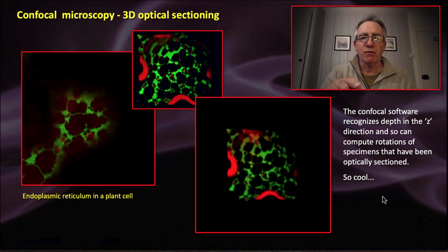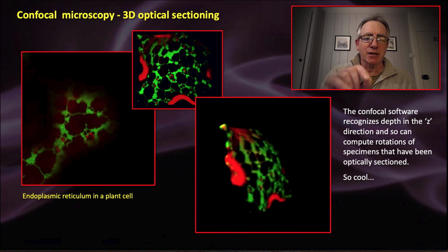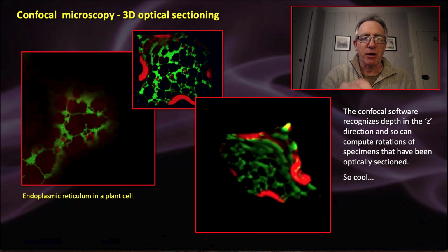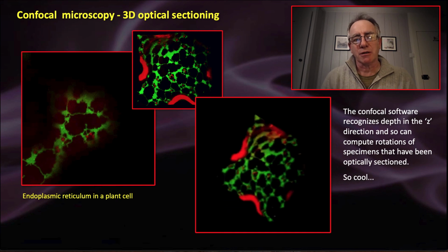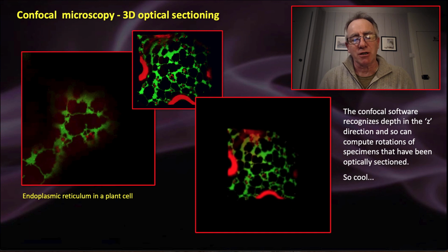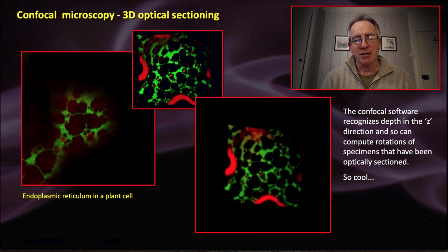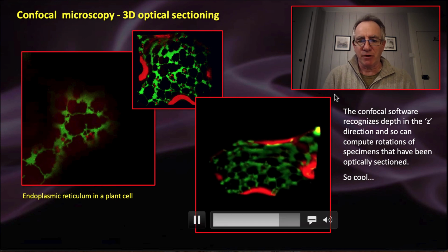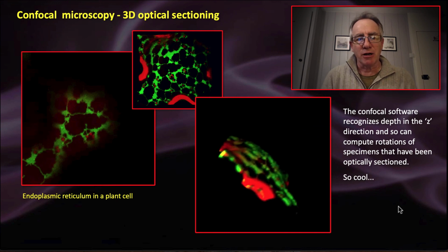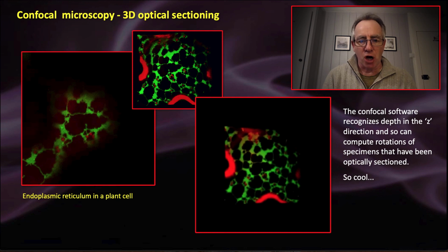I could have, when I finished, taken this little seedling off of the microscope slide, put it into some dirt, and grown it so that it produced the next generation of seeds. I don't think I did that in this case, but I could have, and I have done with other specimens that I've imaged. So it's completely non-damaging, non-destructive, non-invasive.